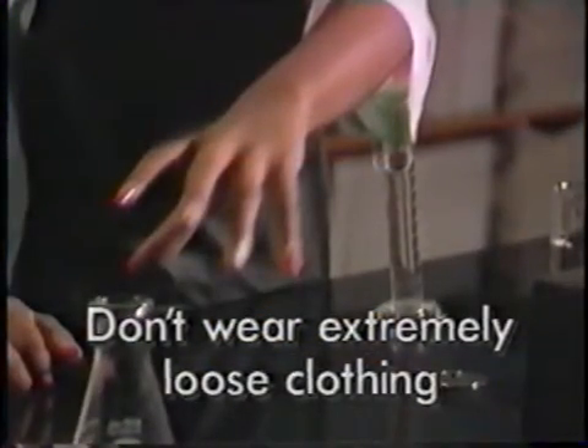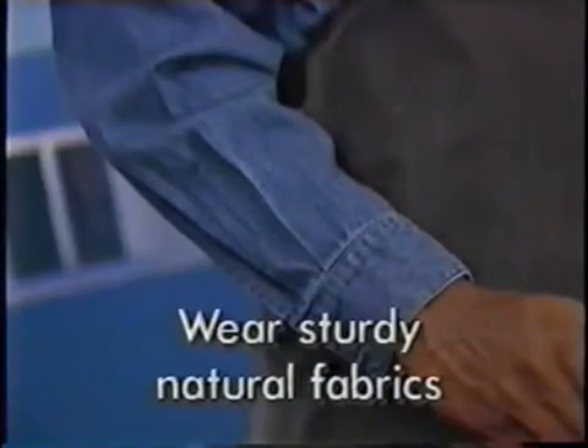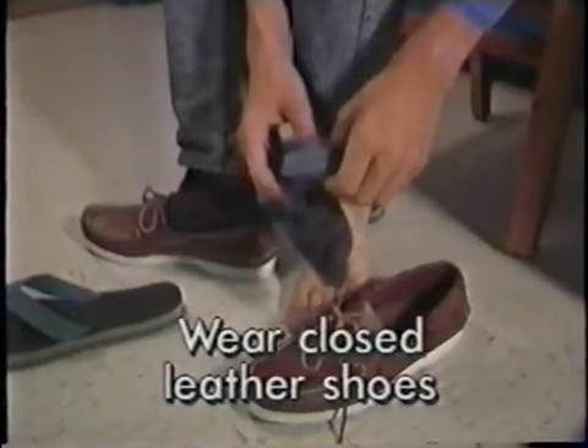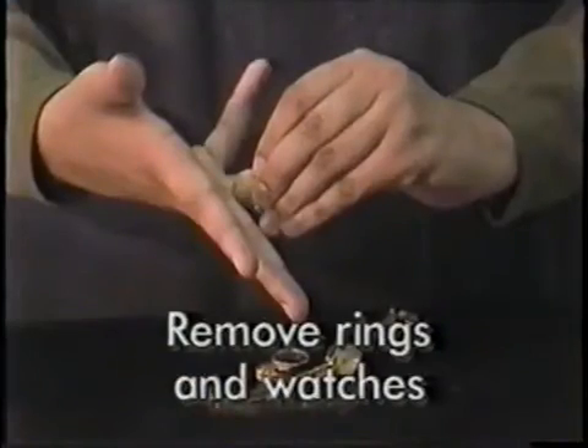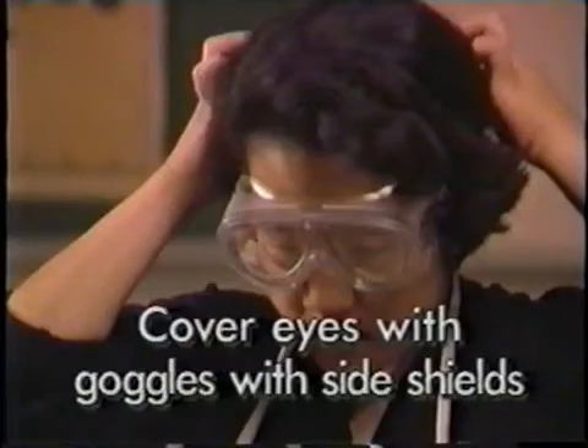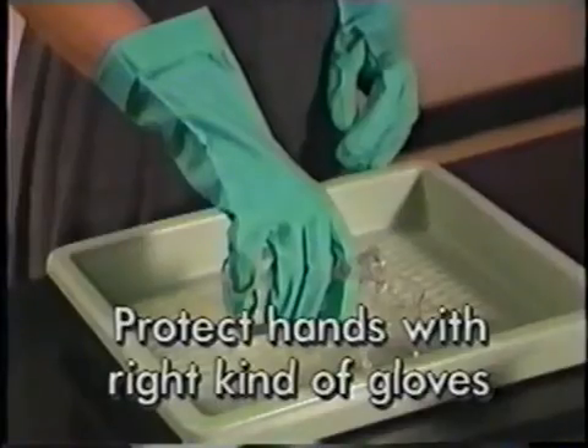Don't wear extremely loose clothing — fabrics should be sturdy and natural. Wear older clothes and cover them with a lab apron. Wear long pants or a long skirt to cover your legs, and closed leather shoes to protect your feet. Tie up long hair, remove rings and watches, take out contact lenses, cover your eyes with goggles with side shields, and protect your hands with the right kind of gloves.